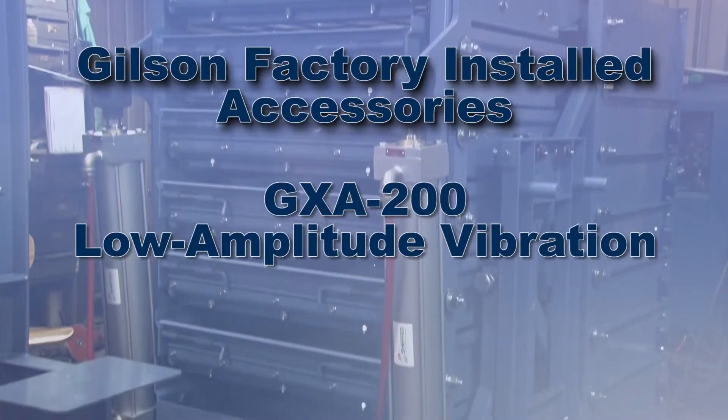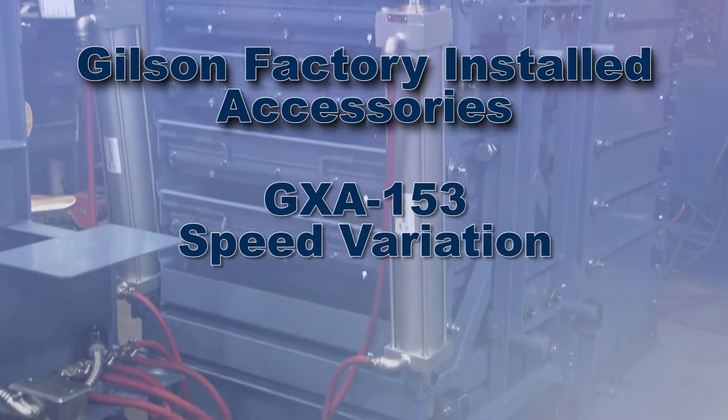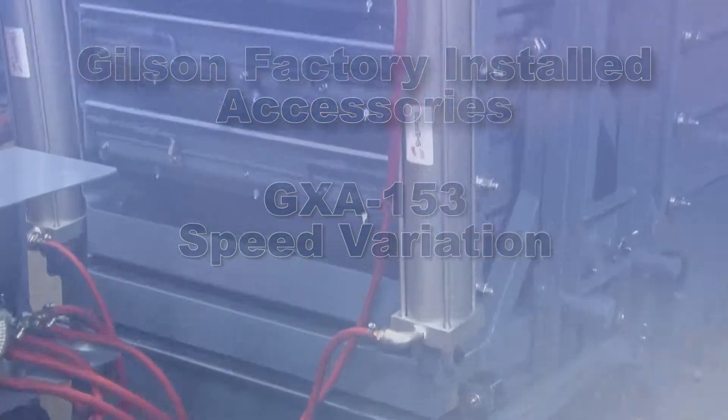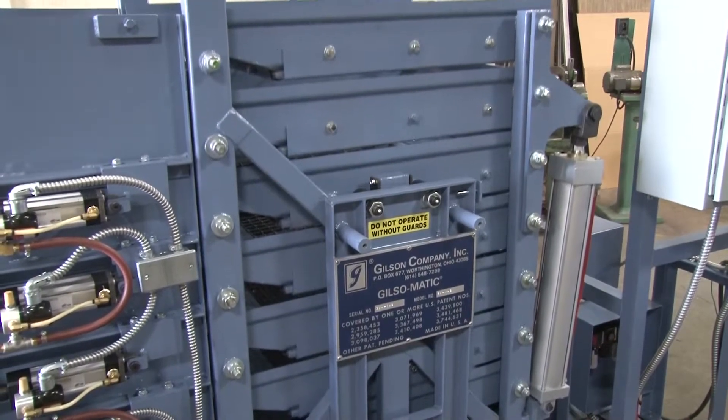The factory-installed Gilsom GXA 200 Low Amplitude Vibration and the Gilsom GXA 153 Speed Variation Accessories can optimize performance to match the characteristics of different materials.